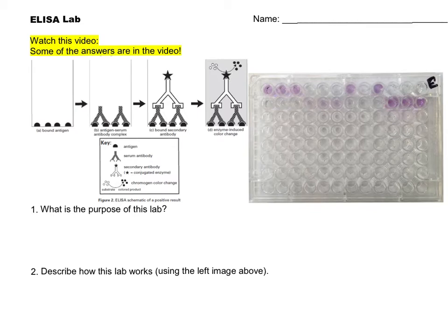specific disease. If a person has antibodies, that means that their body has identified a foreign pathogen and has started an immune response against that pathogen. A person who is not infected would not have their immune system fighting, and thus they would not have the antibodies. So by determining, are there antibodies, we can decide, yes, there are antibodies, and thus this person is infected, or no, there are no antibodies, and thus this is a healthy person.